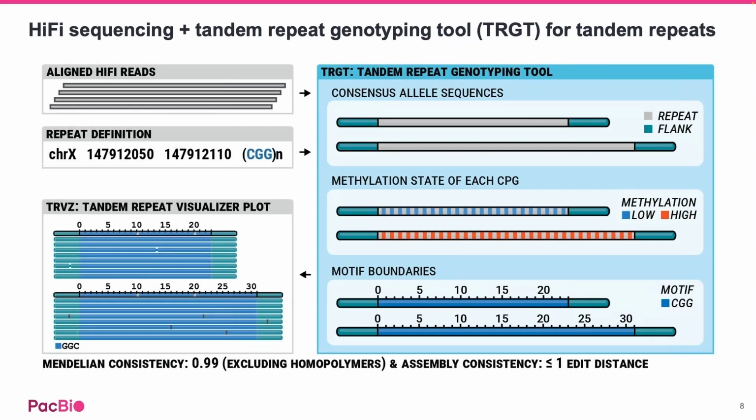All of those are reported at allele level for each genotype, and is all critical information for downstream analysis to fully explore the mechanisms and impacts of tandem repeat mutation on disease phenotype. Also, to help users better understand the results, the tool comes with a visualization tool, TRVZ, to display events at a location per genotype, including the repeat structure, interrupted sequence, and supported HiFi reads.